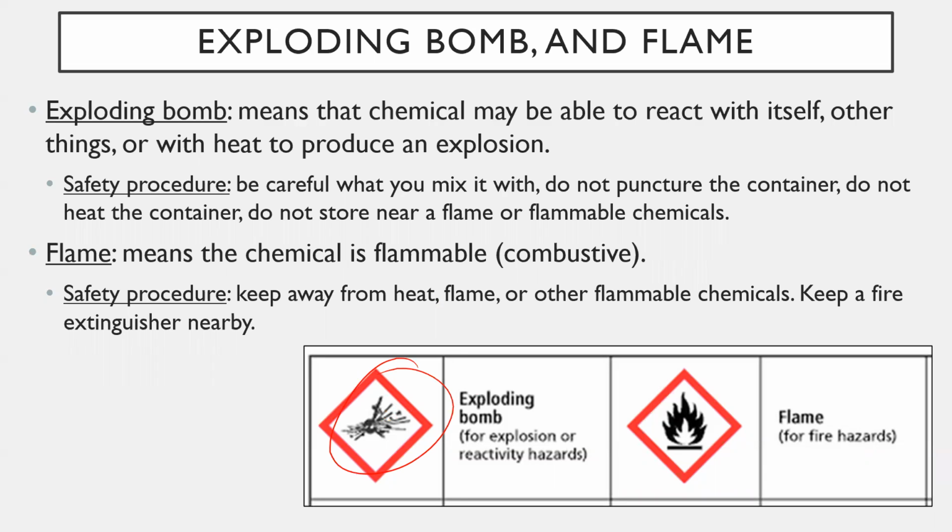So the chemical may be able to react with itself, other things, or with heat to produce an explosion. Okay, read the label carefully to see what it would do in that case. For safety procedures, this is really the important thing. This is what I really care that you understand. Be careful what you mix it with.